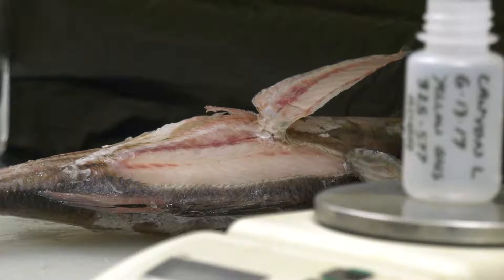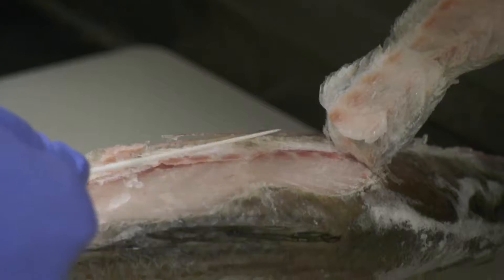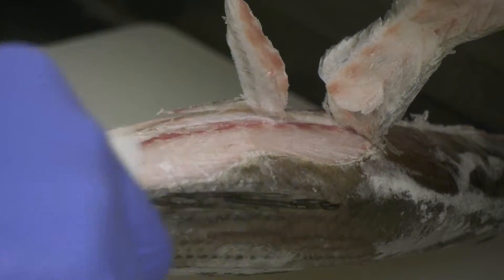When we take the fish, we have to sub-sample the fish because we use just the fillet portion of the fish — the part of the fish that people eat. We try to sample above the lateral line mainly because we don't want to get down into the body cavity where the intestines and the organs are.